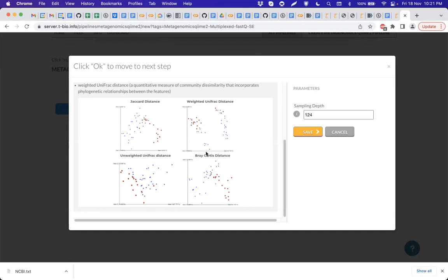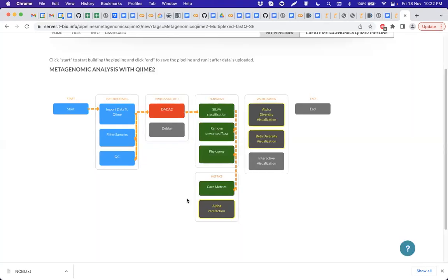If you can perform extraordinarily high coverage sequencing for transcriptomics data, then you will not see a drop in the base calling quality in the read end. That I have seen also. In some extremely high quality transcriptomics data or exome sequencing data, you will not find a drop in the quality of the reads. So you will not find a drop in quality of the reads here also.